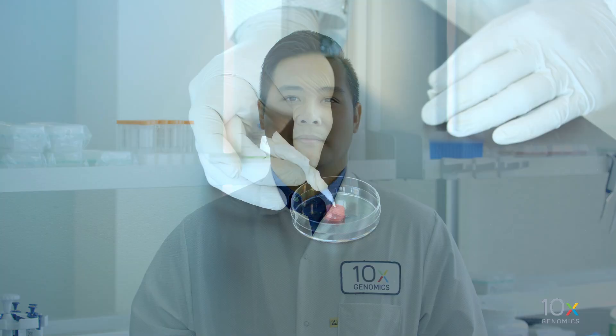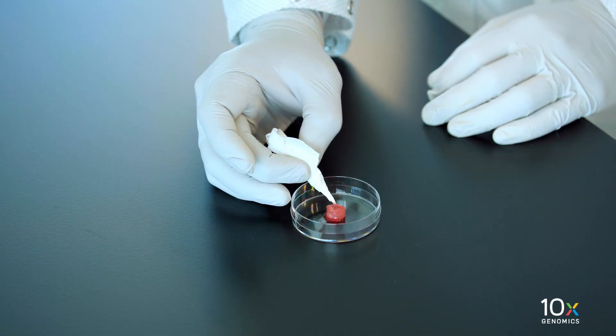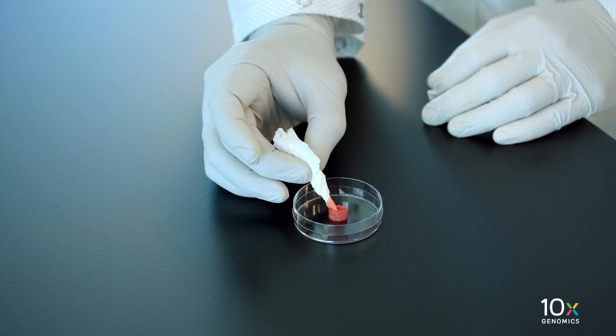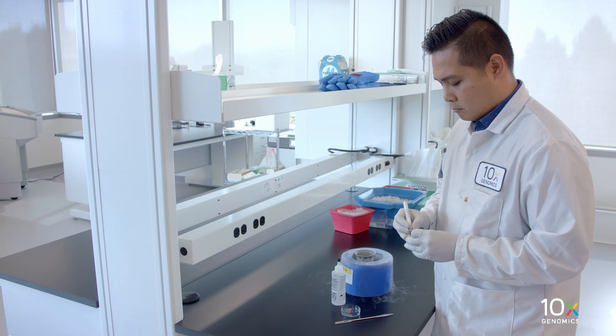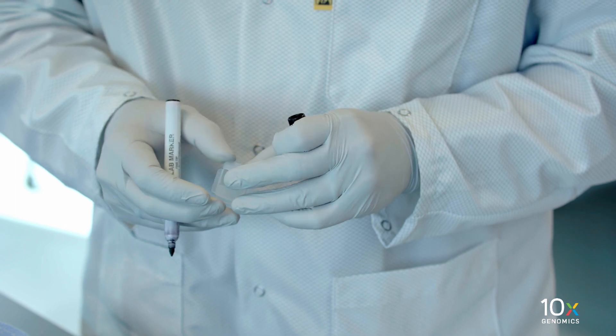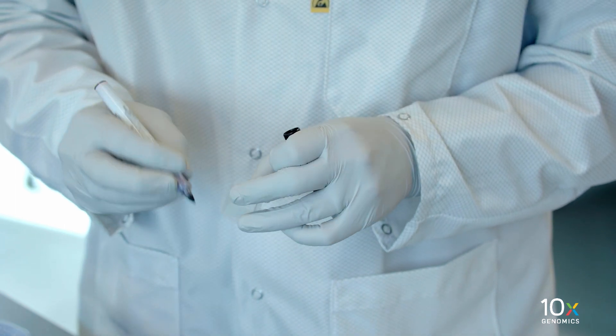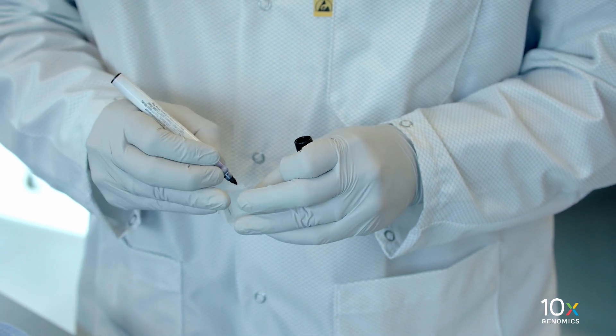Next, we will prepare the fresh tissue. Using a rolled up laboratory wipe, absorb excess blood or solution from the surface of the tissue to limit ice crystal formation. Label the cryomold to mark the orientation of the tissue. Make sure you label the cryomold before adding OCT and tissue, as the OCT will quickly turn white once frozen, making it hard to determine tissue orientation later.